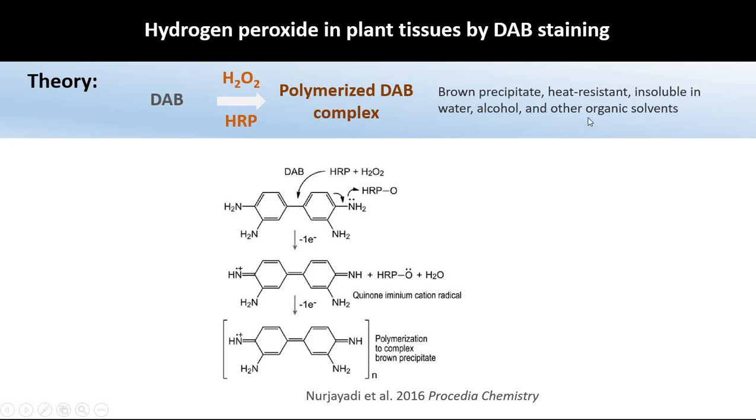This brown precipitate is insoluble in water, alcohol, or any other organic solvents. That is why we can observe it under the microscope, because it lasts for several days.